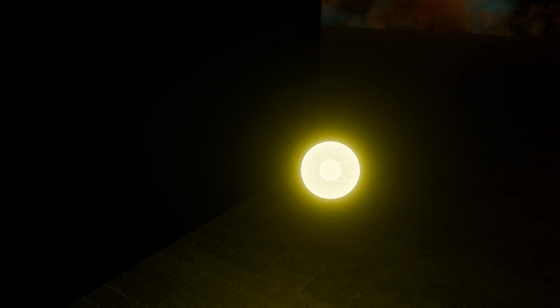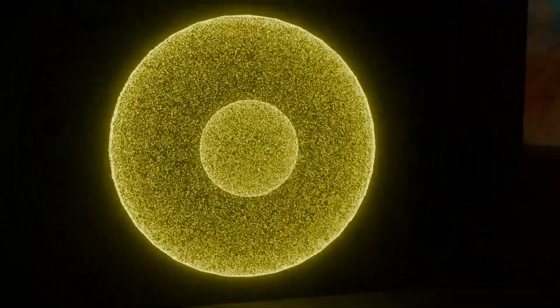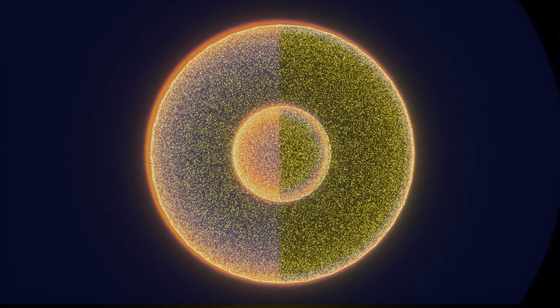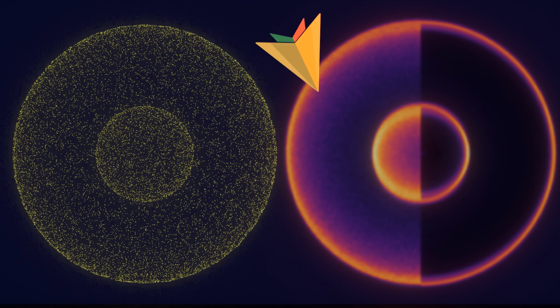The full machine. And now we can ask, I know it's comically late in the video to be asking that, but now we can finally ask, what are we even measuring? So yes, this is the part of the experiment where I explain the electron affinity, and I'd just like to take a second to pause here because holy shit, this image on the left is what I just made in Blender, but this image on the right, that's actual electrons.